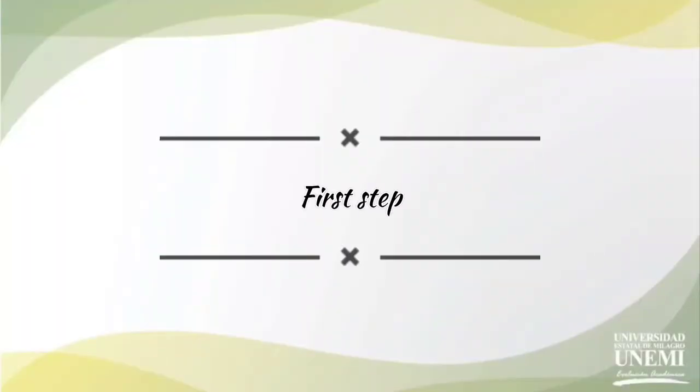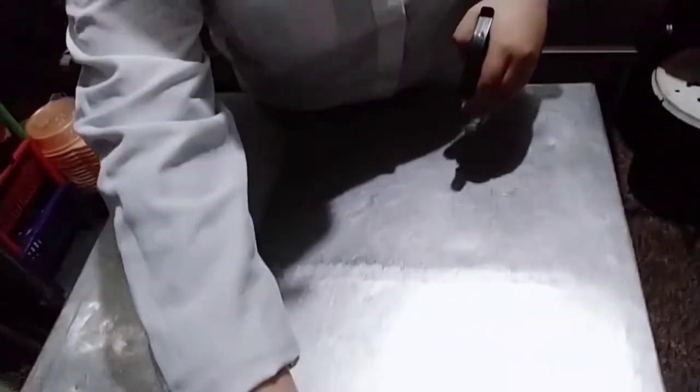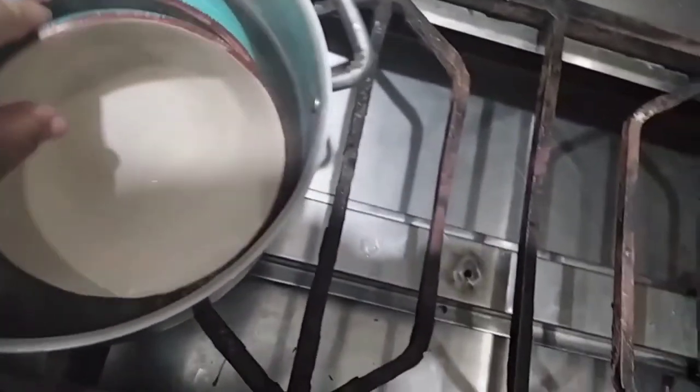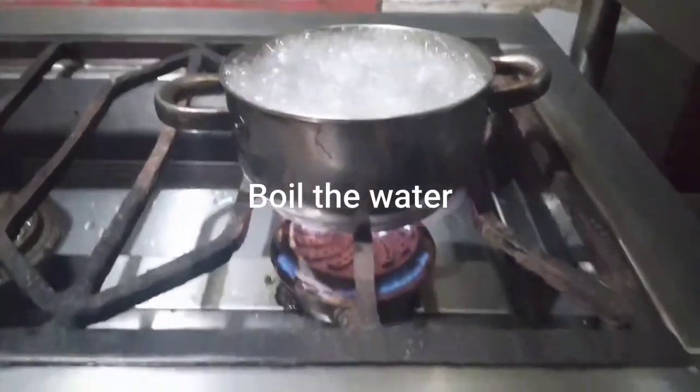First step: we are going to sterilize our work table with alcohol and we are placing six candles around it. Also, we are going to sterilize all the materials that we are going to use.